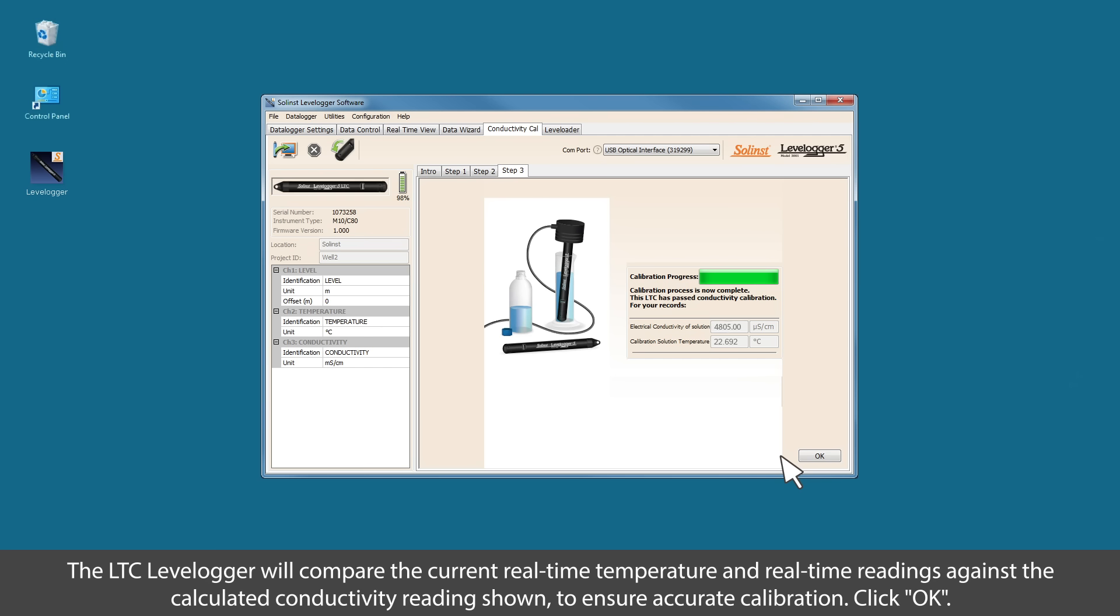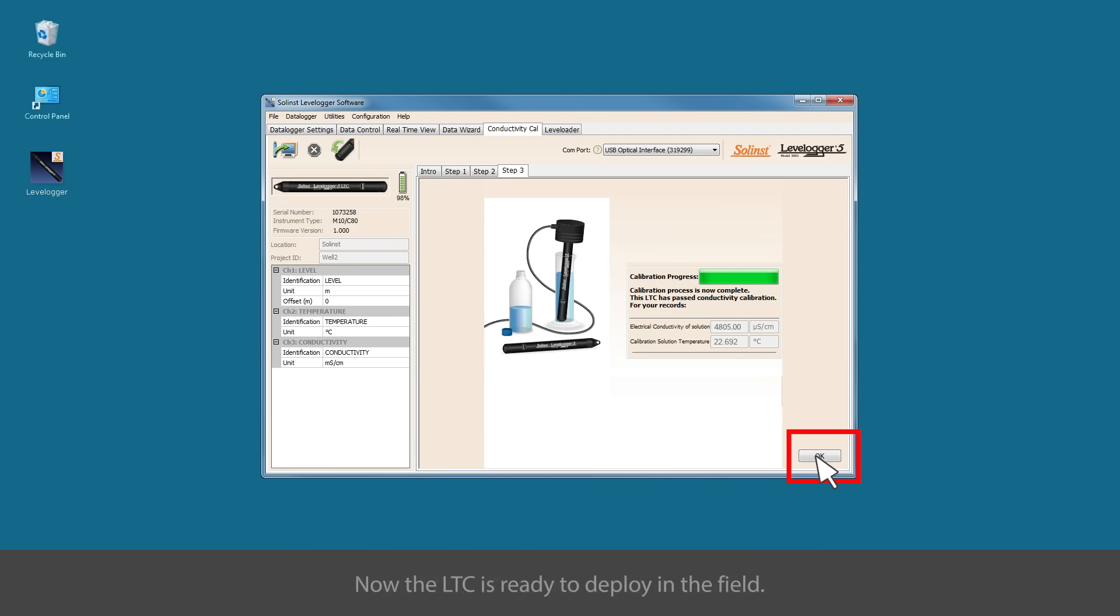Then click OK. Now the LTC is ready to deploy in the field.